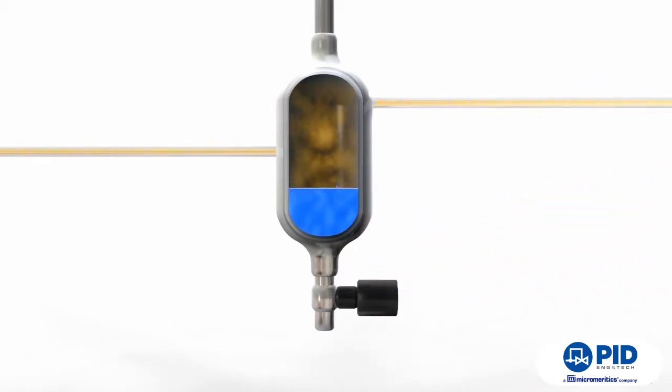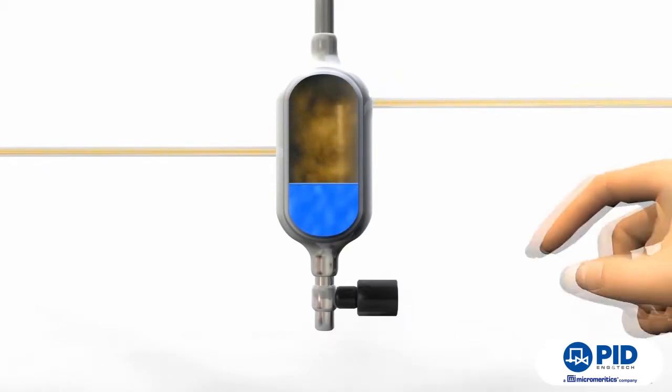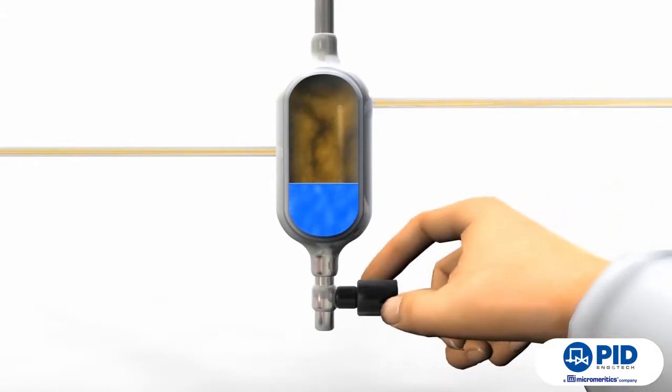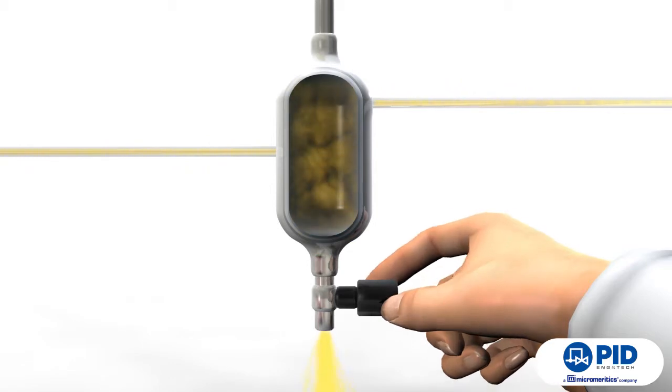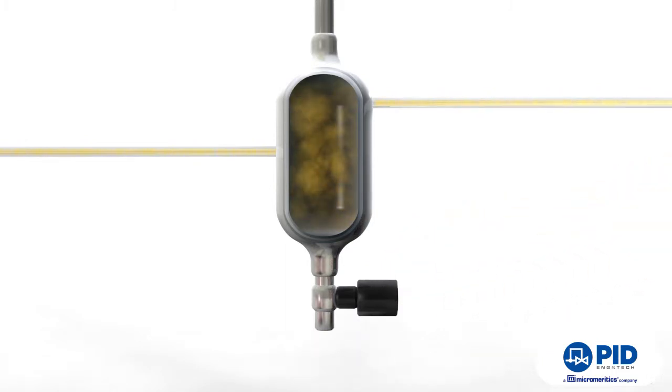Furthermore, this procedure is not possible in systems operating at pressures higher than the atmospheric, like the Fischer-Tropsch synthesis, which takes place at pressures up to 60 bar. This is due to the loss of the hydrostatic seal at the bottom of the separator, which would lead to a major leakage of gases.